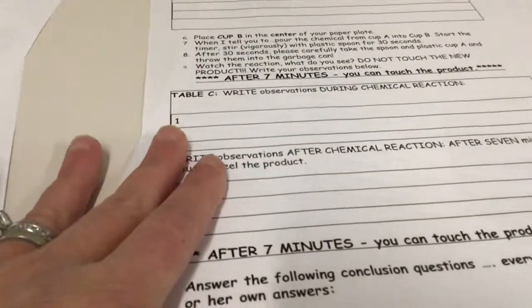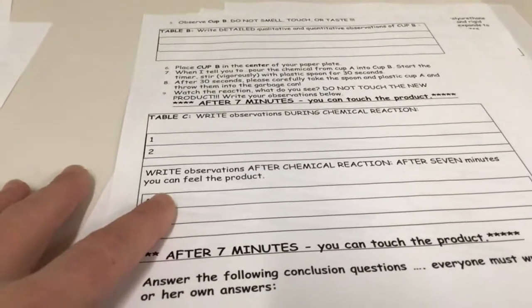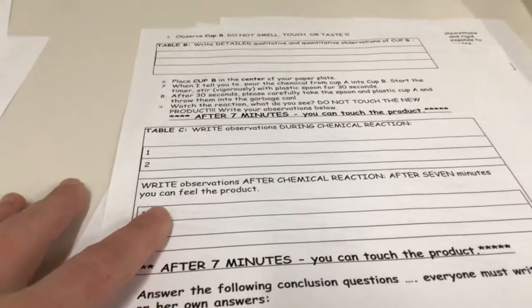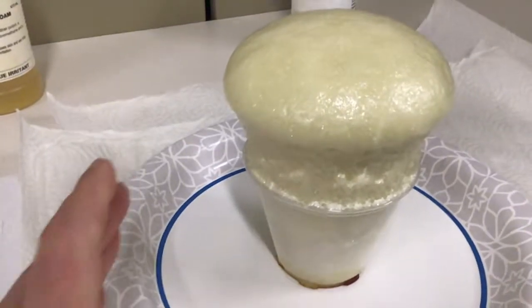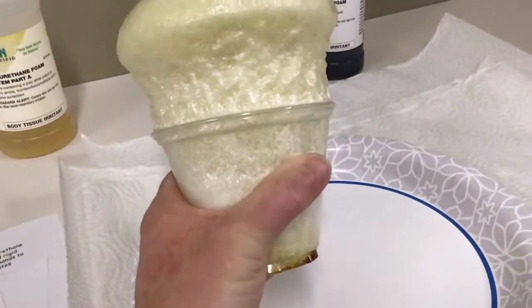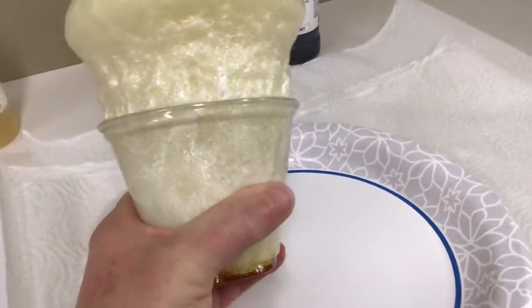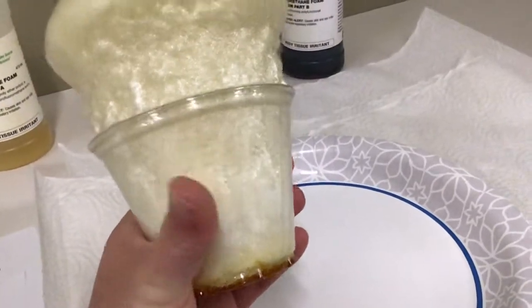All right, so we are going to be right here, so stop wherever you are, and we're going to be writing or typing observations after the chemical reaction. So it's unfortunate that you can't necessarily feel it, but I will try and do my best so you can capture this. So it definitely is toasty roasty. It is definitely warmer than it was before. These two liquids were at room temperature.